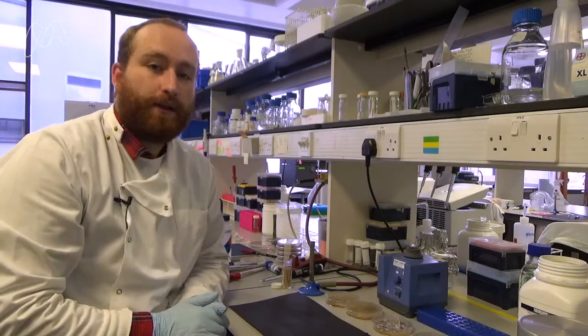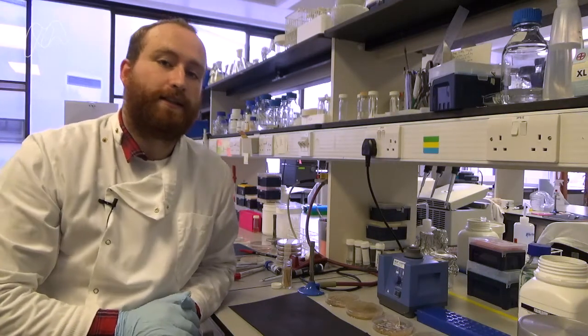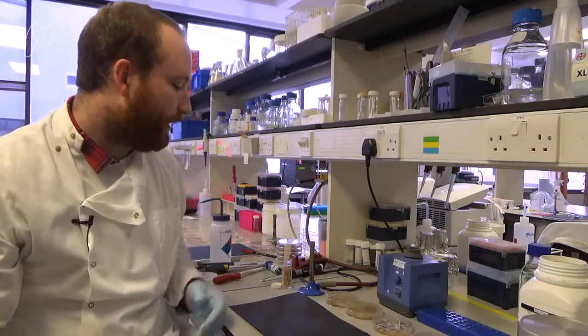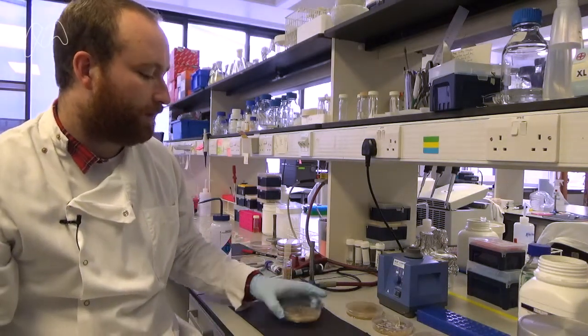Hi, it's Jake. Today we're going to be looking at some bacterial colonies. These are soil samples that have been grown up in the lab, and we're going to show you what we're looking for.